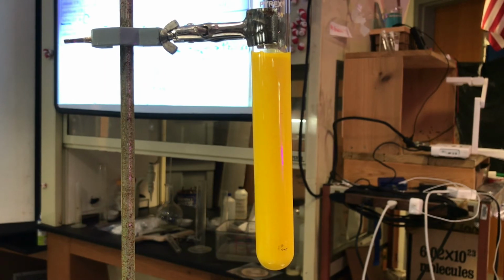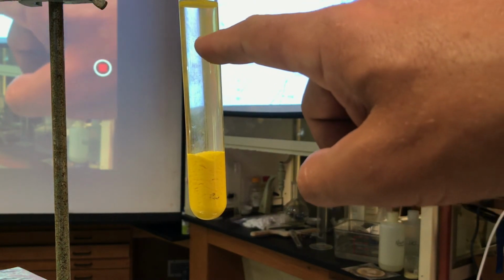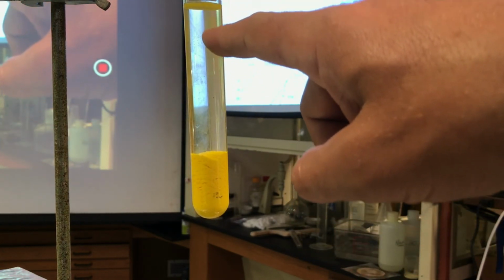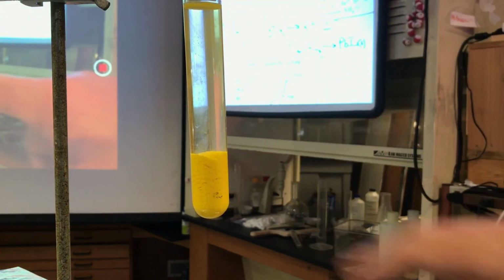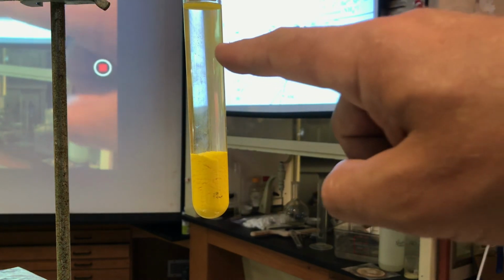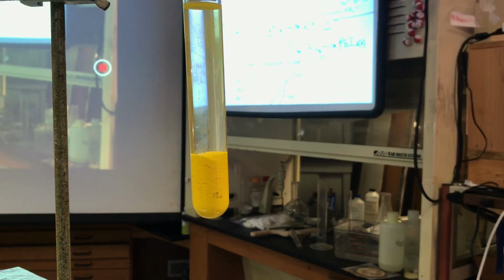So there's an example. This precipitation may give you problems in a battery if you're using the wrong ions. This looks a little different than what you saw a few minutes ago, because the precipitate, being more dense than the solution, eventually settles to the bottom. What you should recognize is that what's left in the solution is what's spectating. And what is spectating?